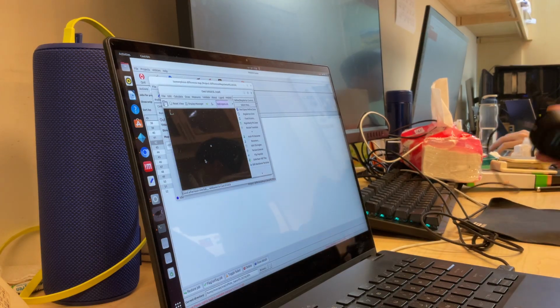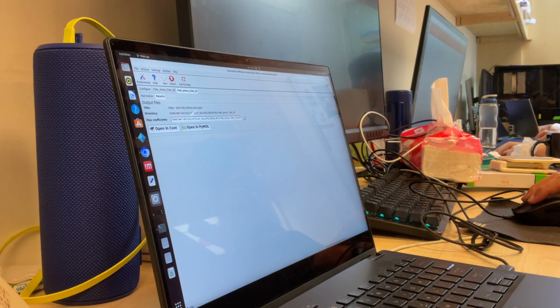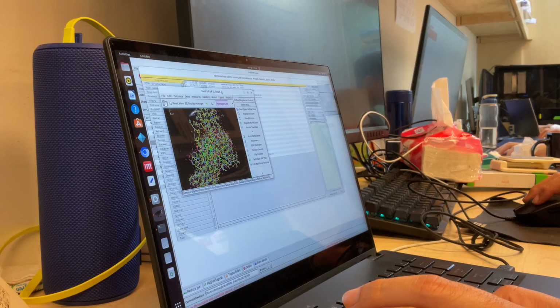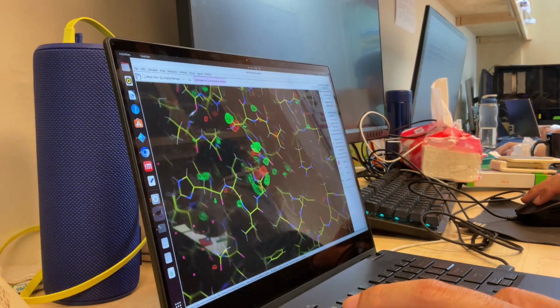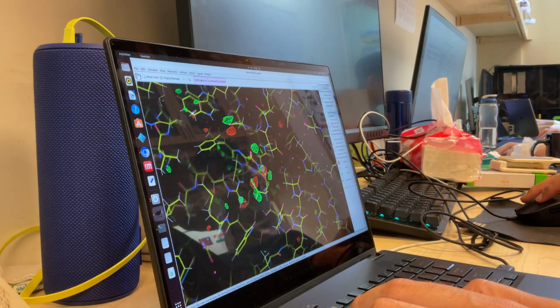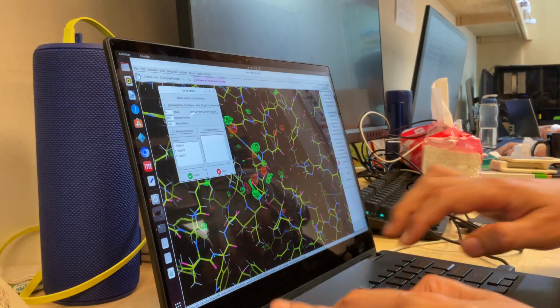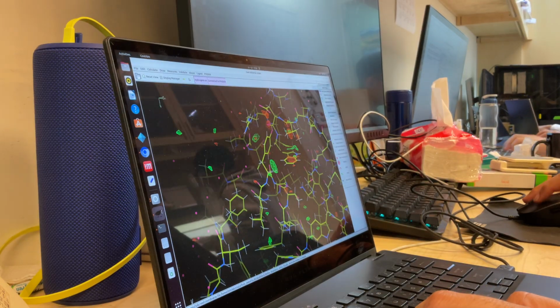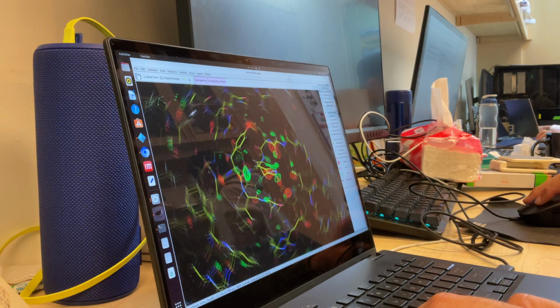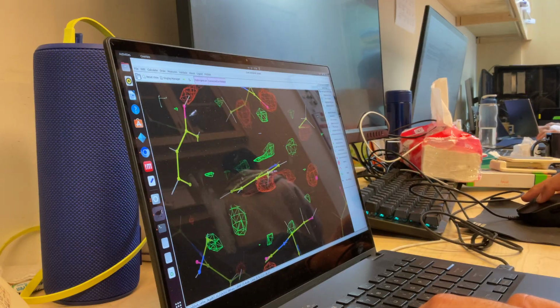So we can open it. And here we have the map, and we can see quite nicely those differences here. Let's go, what's the tryptophan? Well, we can go to 373 and it's right next to it. Yeah, here. And if we set it to 3 sigma, here you have the data, and it looks quite nice.